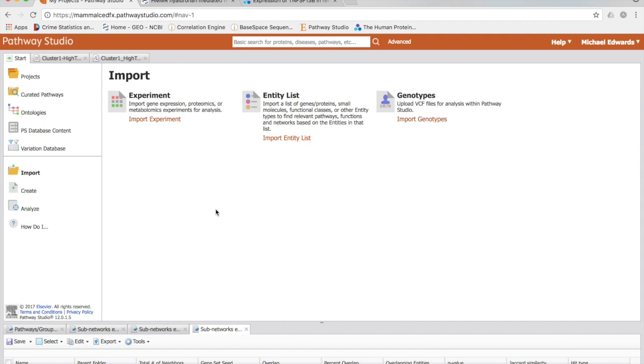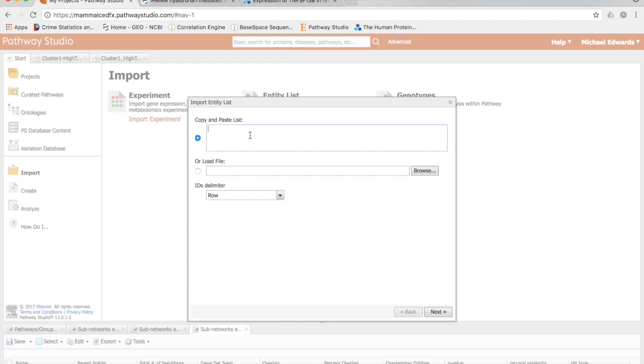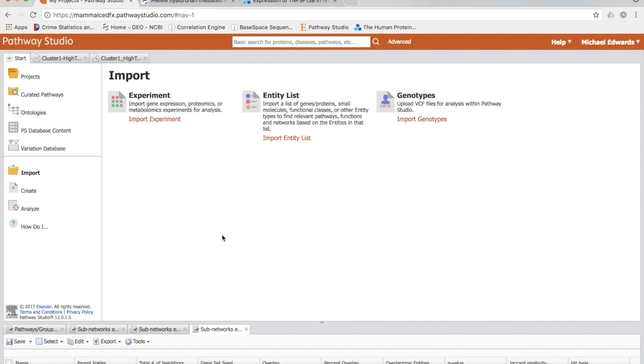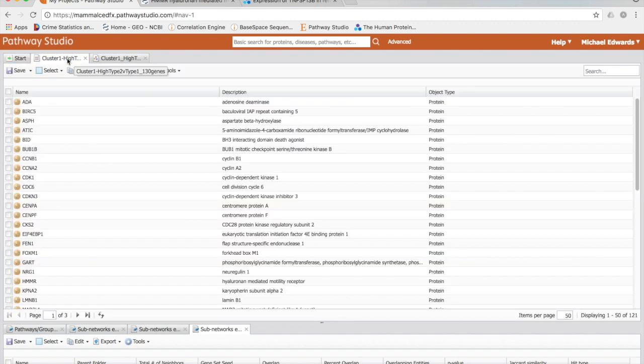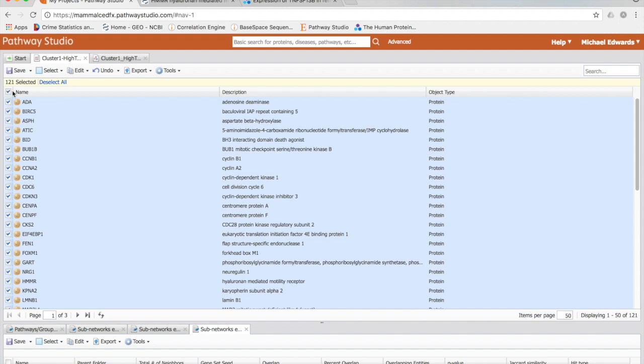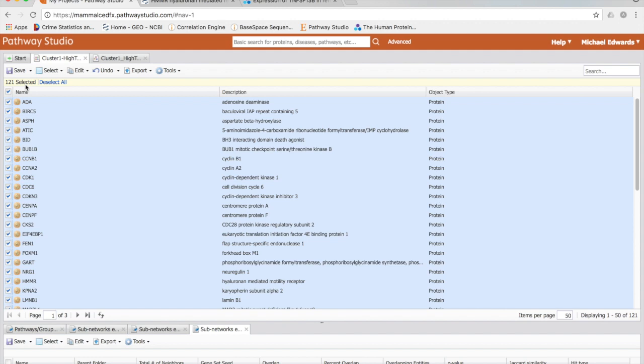In order to import our 130 genes into Pathway Studio, it's a pretty easy process, very similar to String. Basically, we're copying and pasting our gene list in. Just like with String, we're not putting in fold change information into this program. I'm not going to go through this, it's pretty self-explanatory. I have already done this, and given here is my list of genes that we have imported.